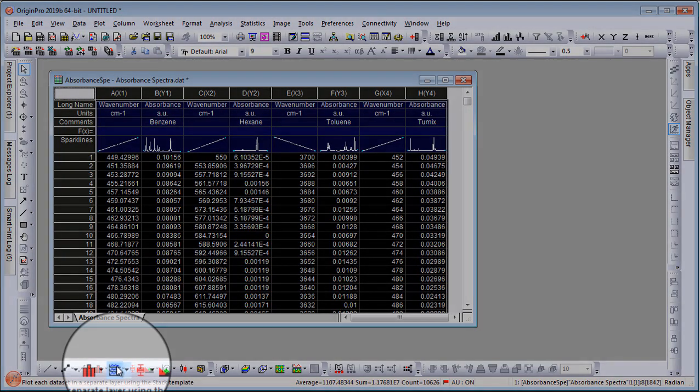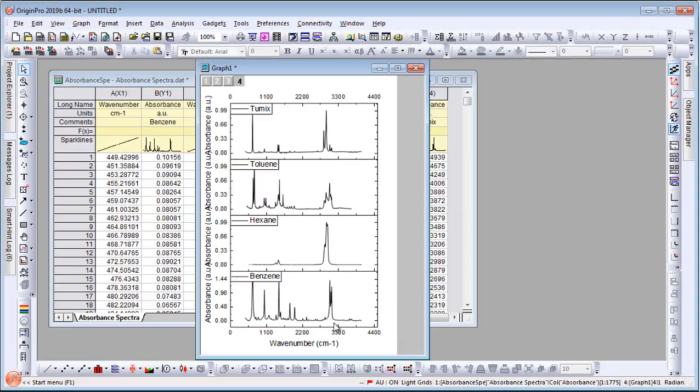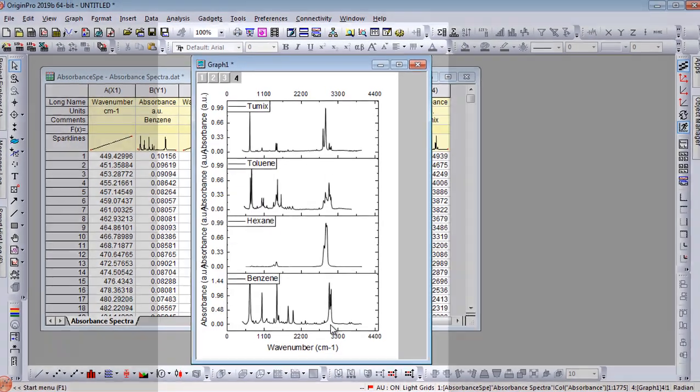Then, simply select the entire worksheet and click on a desired plot button to create a graph.